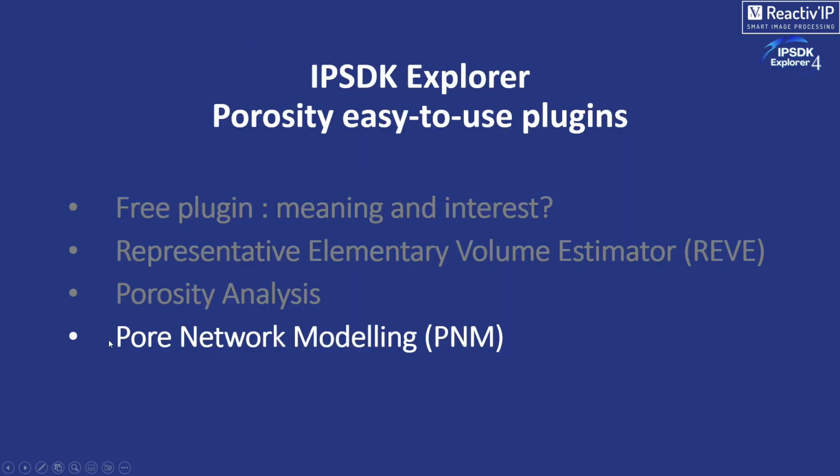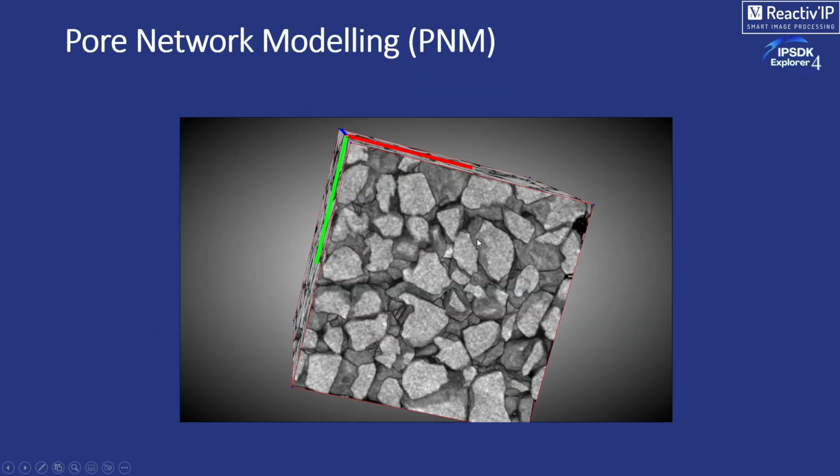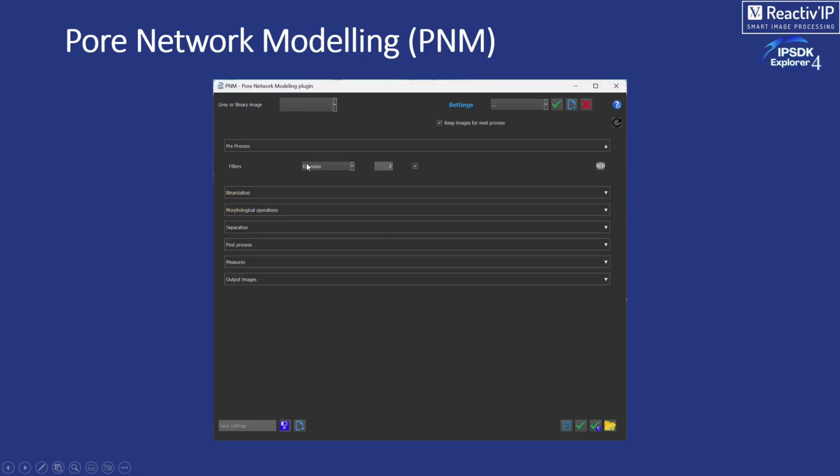And now you can also get Pore Network Modeling. If you're not interested in isolated pores, but in a real tortuous or a connection of the pores, we have also a plugin. If you have this type of data set, which are rocks, and you can see some porosities between the grains, you can just use exactly the same strategy. So you can see that it looks like the same graphical user interface, or same philosophy.